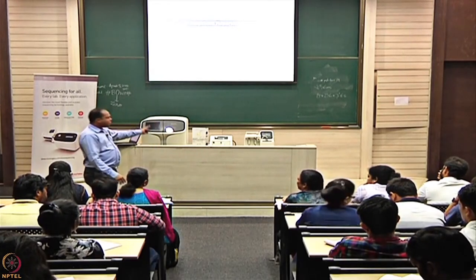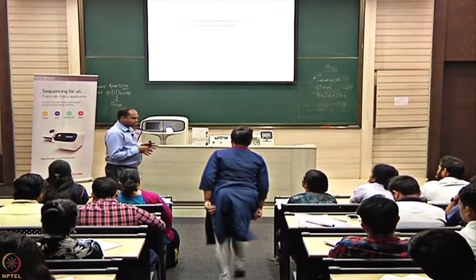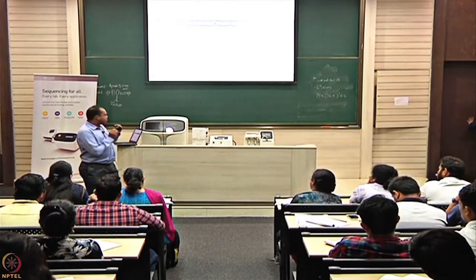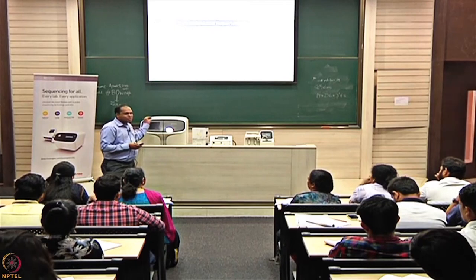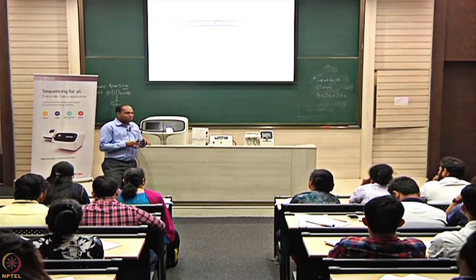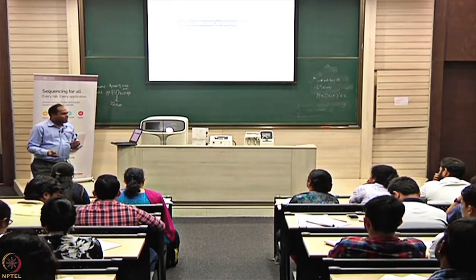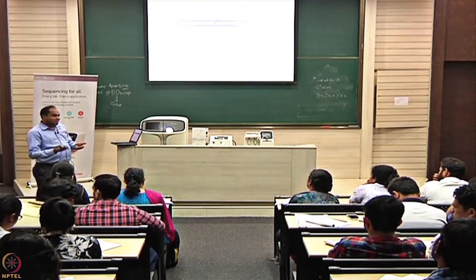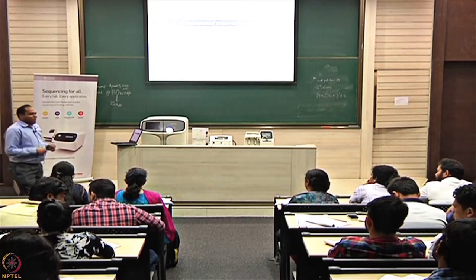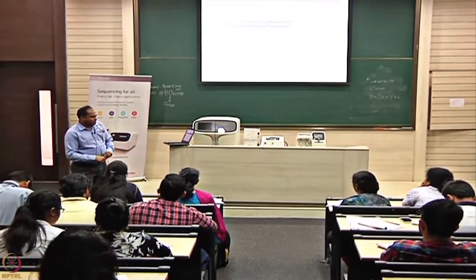Over here, we have everything on the system itself. What we have done is, it is like an appliance, like your toaster, where you're just putting in your data or doing sequencing and generating your data. You can't touch that particular system anywhere. You just have to access it through a web browser only. So nobody can access it externally unless there's a service person coming in. We take the data coming out and do the analysis on the cloud.